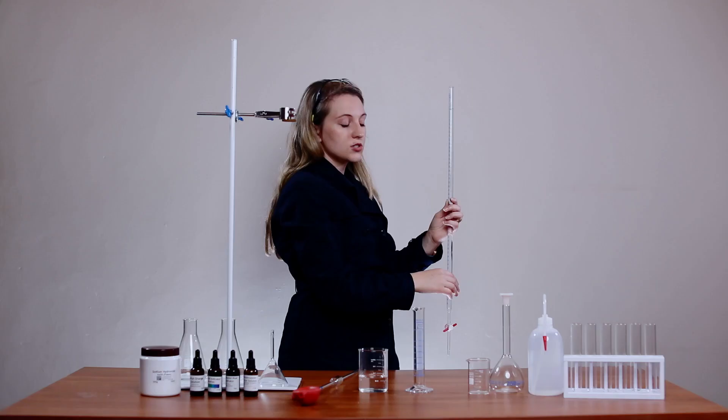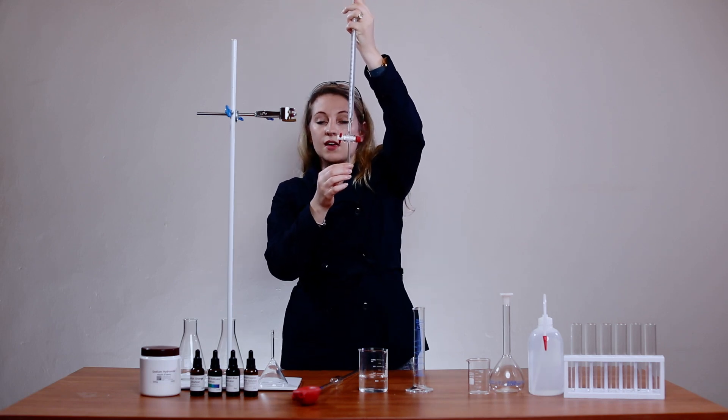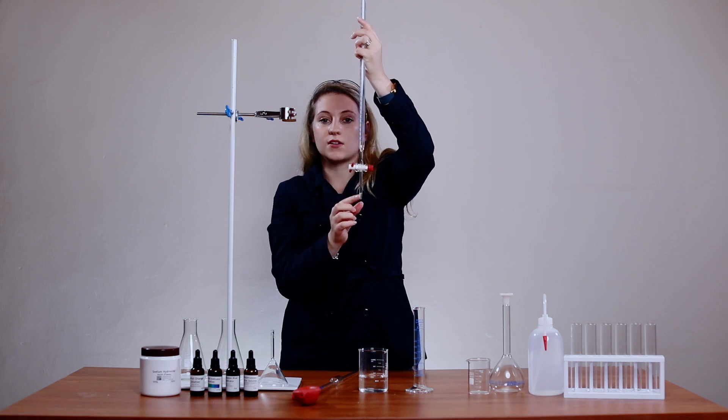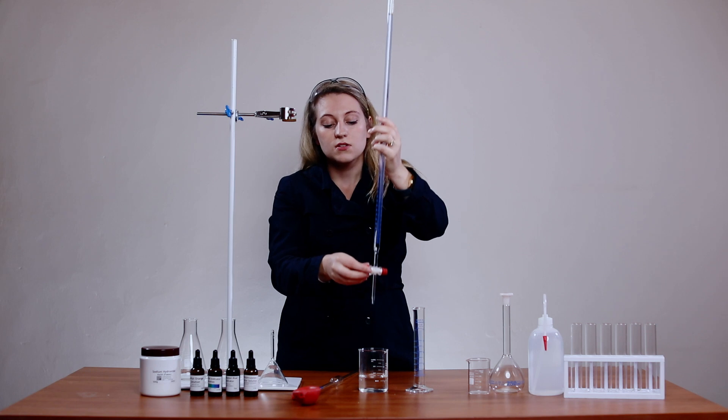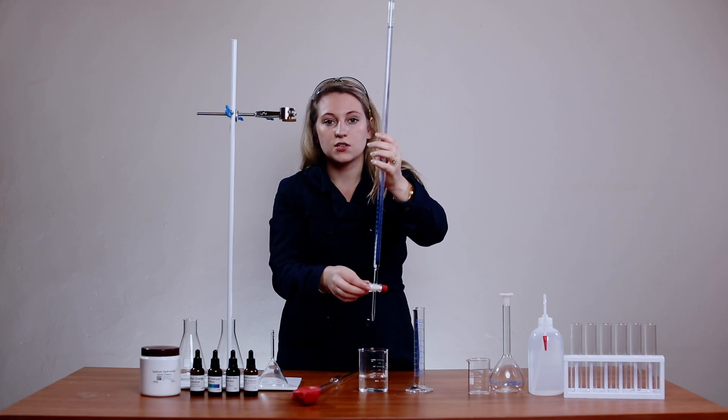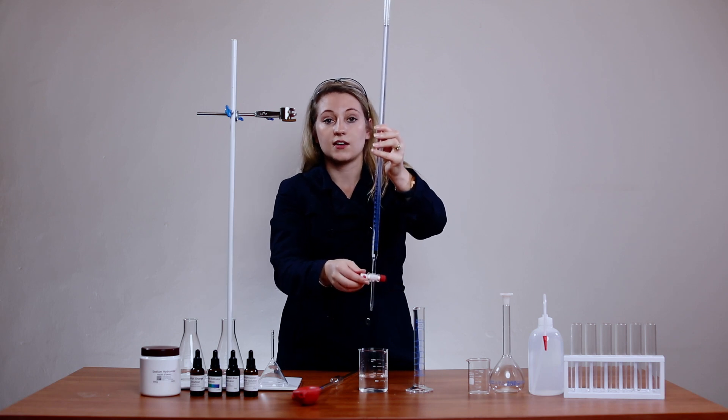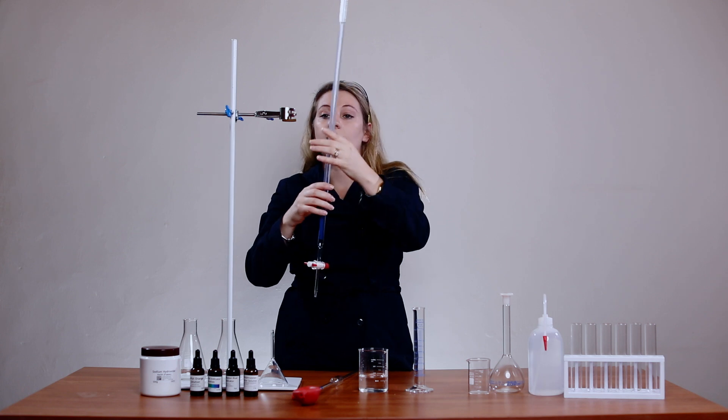Another thing that you should look out for when performing a titration is air bubbles. You need to ensure that there's no air bubbles in this area below. If there is an air bubble you need to open your tap, shake your liquid and close it again to ensure that you've got no air bubbles because that might influence your accuracy.